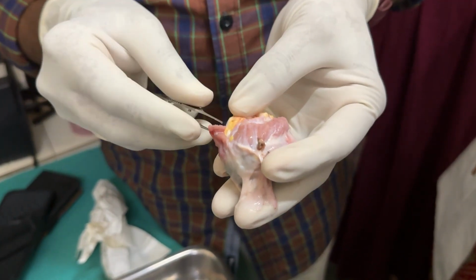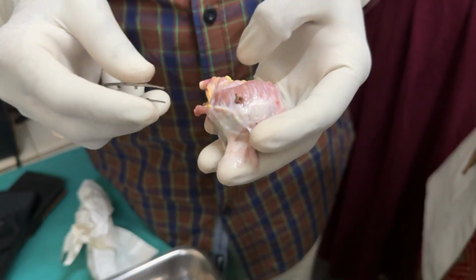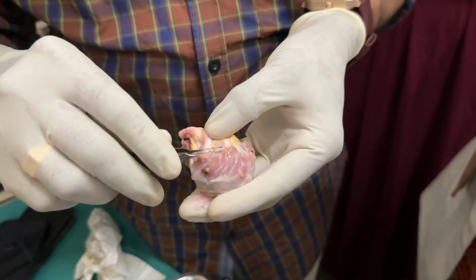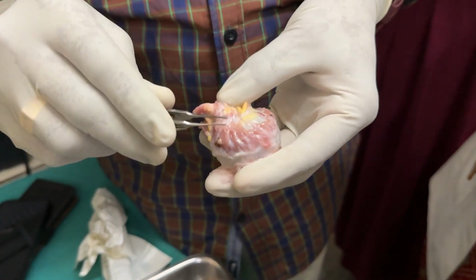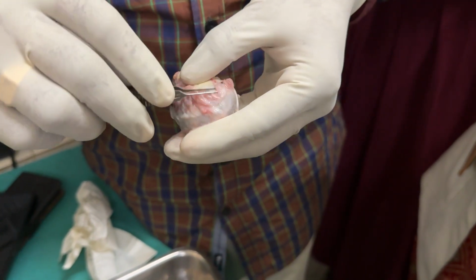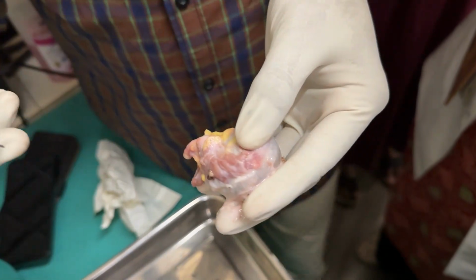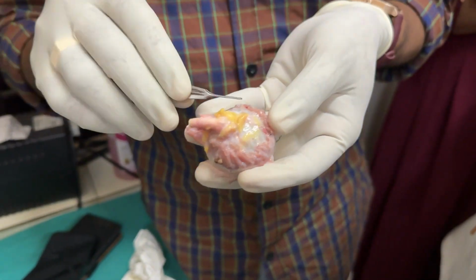You see, this is the medial rectus. The fibers of rectus muscles you can separate like this. Understood? So there will be a gap in between the muscles. There is a muscle-free area that usually separates the lateral and medial areas. Okay, lateral and superior like that.